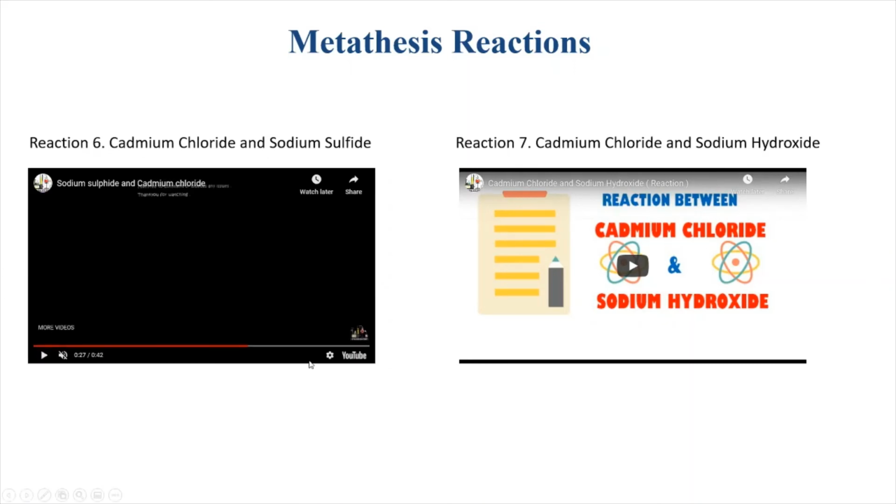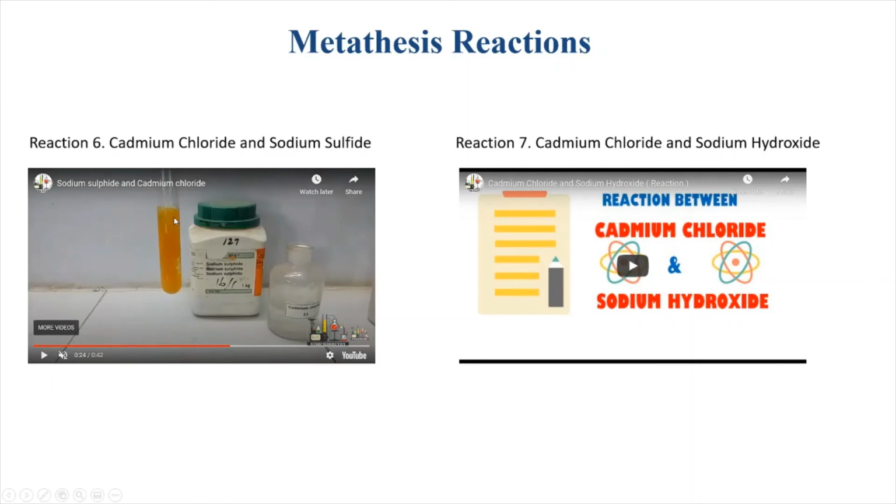Okay. So if you were to centrifuge that down, so this is the solution, and separate the solid that formed from the supernatant, you would have a slightly off-white, off-transparent supernatant, the color of the sulfide, and a nice orange precipitate down at the bottom.